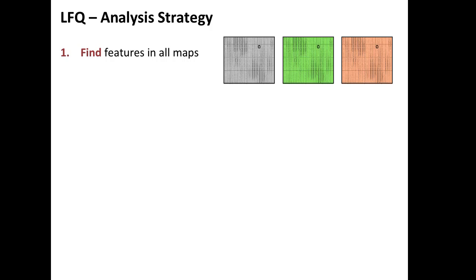Label-free quantification is really straightforward experimentally, you would just have 100 samples, you measure them independently. The trouble is now in the data analysis. It's not in measuring that stuff. Although there are issues there as well that we can talk about later on. For example, measuring 1,000 samples on the same column is just not going to happen. But for simplicity's sake, let's assume we got 3 samples. We measure them independently. We know there are peptides in there. We did a bottom-up experiment, shotgun proteomics. We have something that's gray, or actually on my screen it's blue, and green and red.